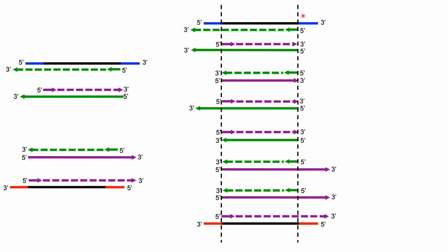So again, you can go down and see now we are starting to generate a good amount of the correct length product. Here we have a new one, here we have a new one, here we have a new one, here, here, and here. Okay. And in terms of generating overlength product, again, it's only going to be from our original templates here on the bottom and then on the top.